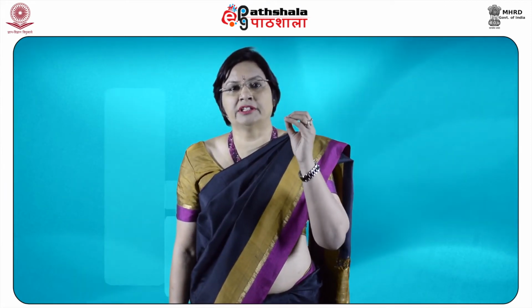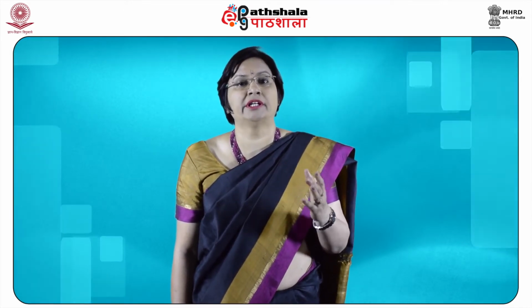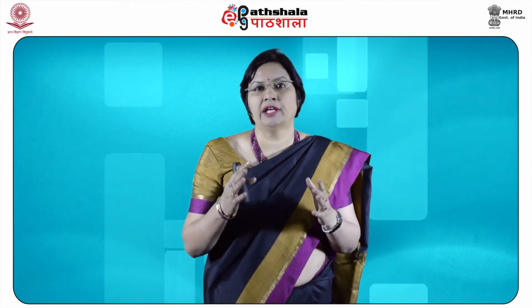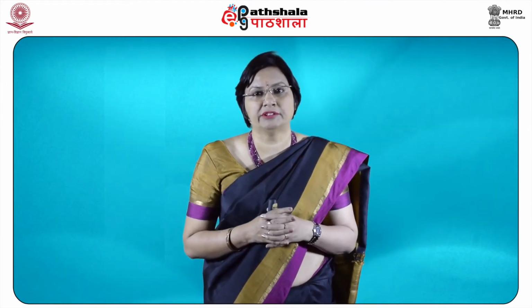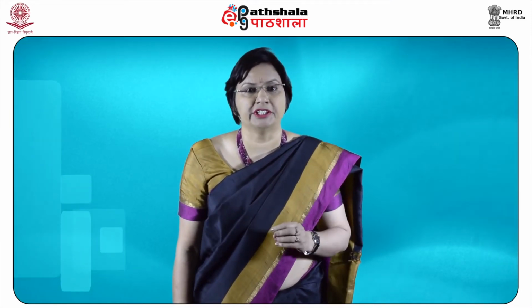And we shall discuss some various classes of organic molecules, including compounds containing oxygen, sulfur, nitrogen and halogens, and how the alpha, beta, allylic and benzylic cleavage happen. And we shall have a detailed discussion on the McLafferty rearrangement.